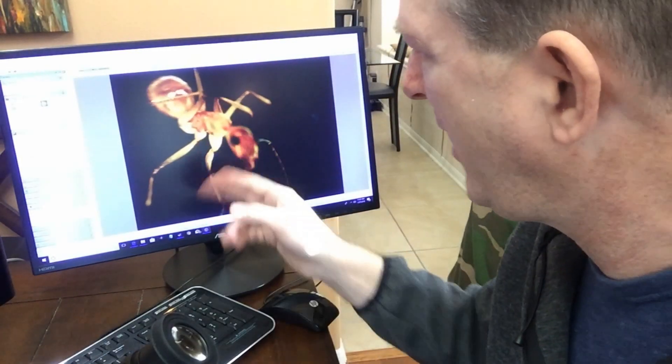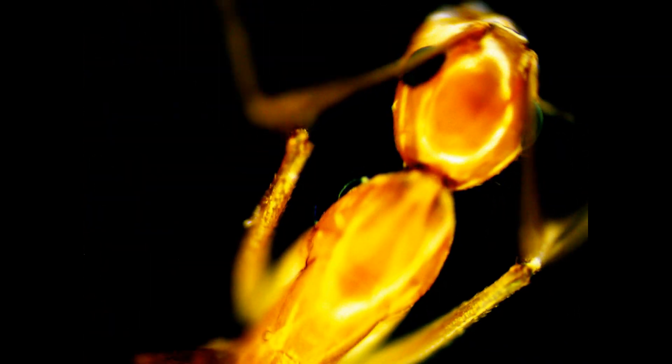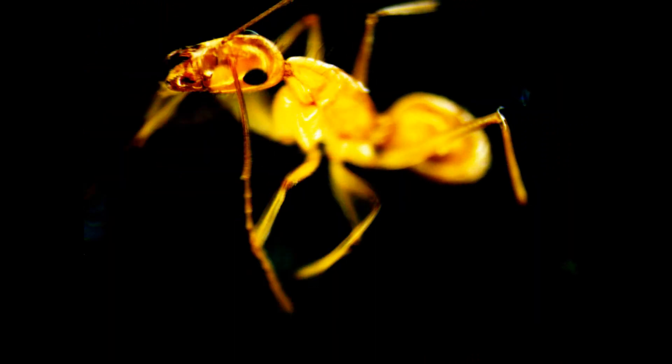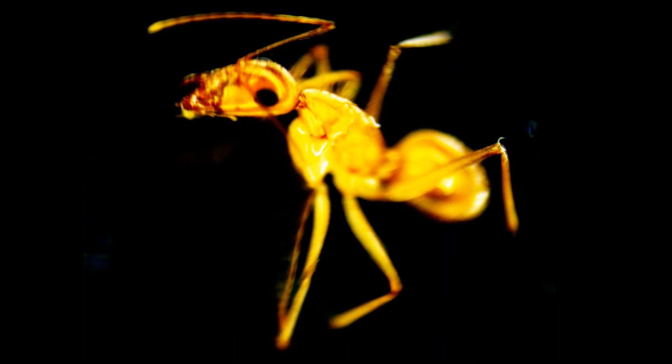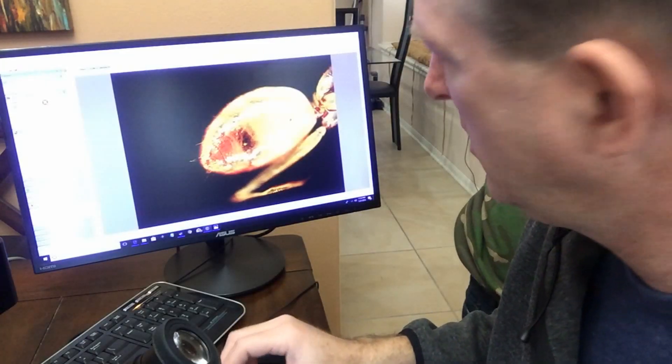Okay, so here we are. We have our ant and we are taking a look up close. We're probably at about 40 times magnification right now, and it looks like it's cleaning the antenna.